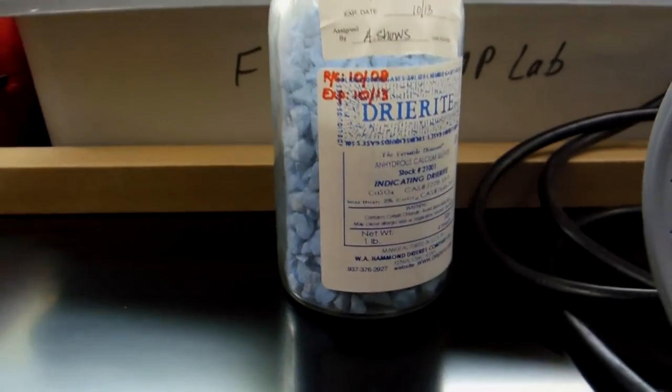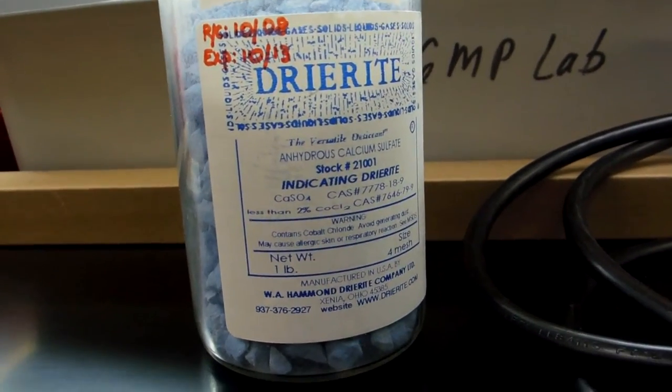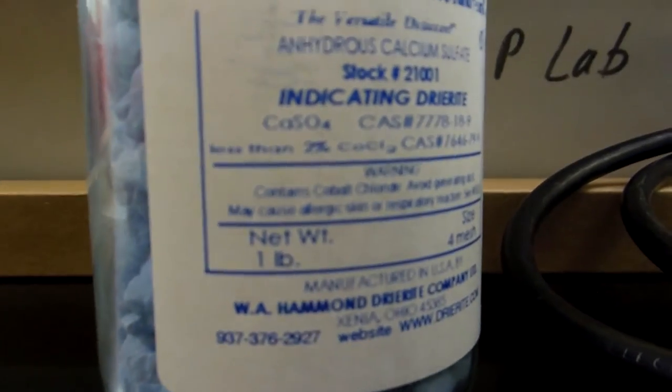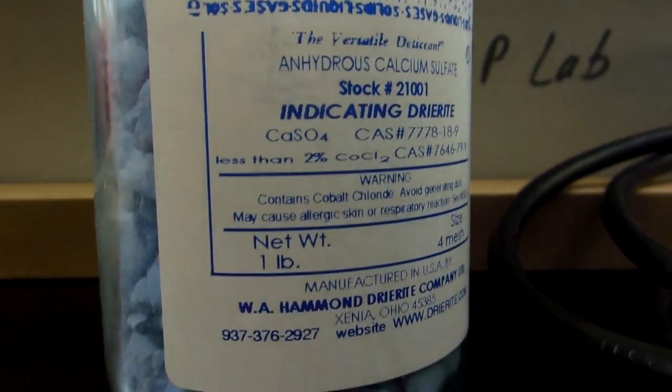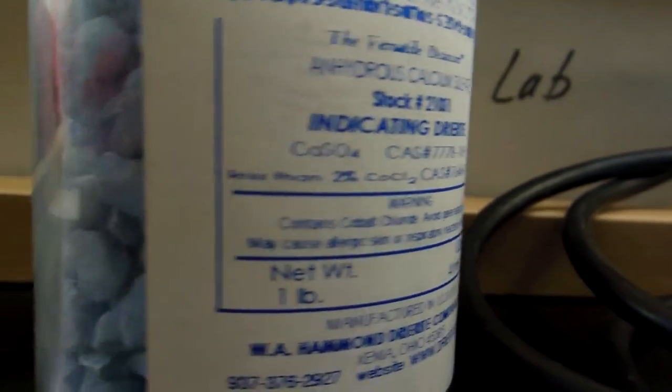So I will now dry the silver chloride powder after taking it out and neutralizing the liquid from the jar and the liquid from washing through the filter paper with tap water. Basically, I mix the baking soda with a stirring rod until it stops fizzing.